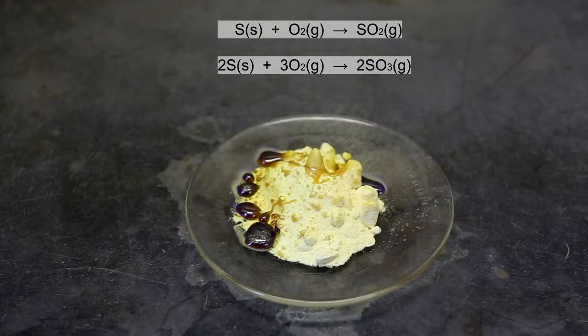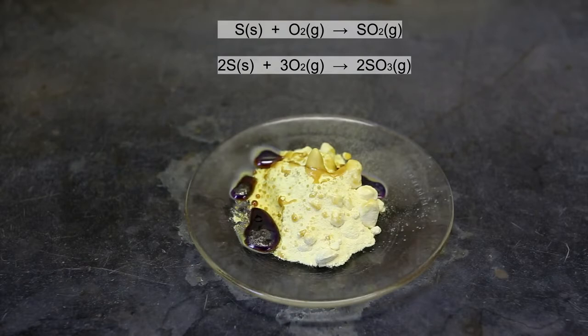Eventually, all of the sulfur will be melted. In the light, it is a little difficult to see that there is actually a blue flame being emitted from the burning liquid sulfur. If a larger amount of sulfur is burning, the blue light is much more evident.